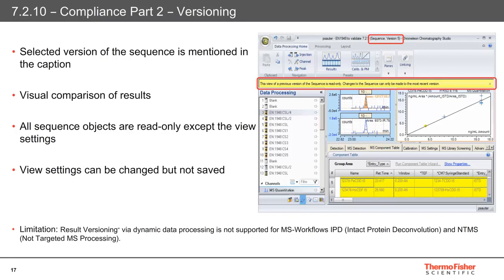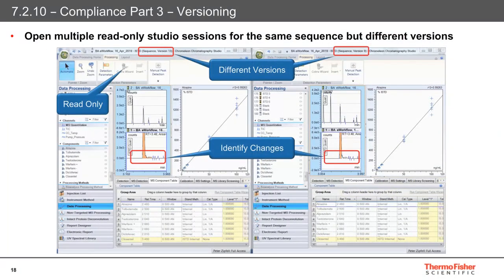This is clearly highlighted from within the associated category. Changes that affect the data cannot be made, although the view settings can still be altered, for example when overlaying chromatograms or navigating to different layouts. Any changes made to the view settings will not be saved, so that the integrity of the original data is maintained. We can also identify the version of the sequence and carry out a full investigation where necessary. Taking the visual comparison a step further, we can also open up multiple studio sessions for the same sequence, providing a powerful and definitive way to compare and contrast changes from different versions. Here we can identify the changes clearly while providing justification and reasoning behind any manipulations to the data or its associated objects.